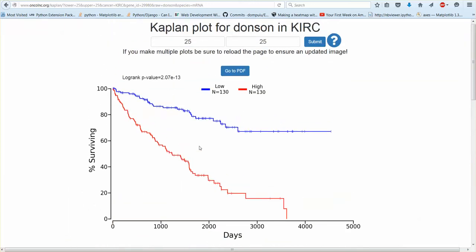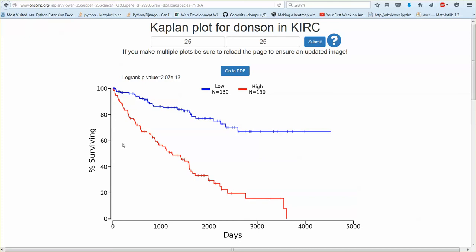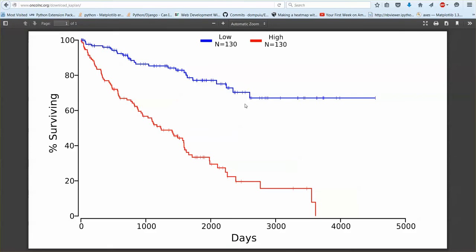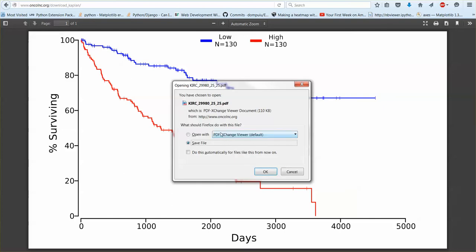And then if you want to use this plot in a publication all you have to do is click this button here. It'll take you to a PDF like this and the file will be named exactly the same, same thing.